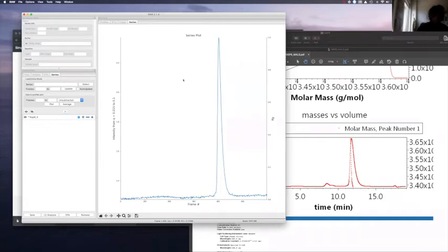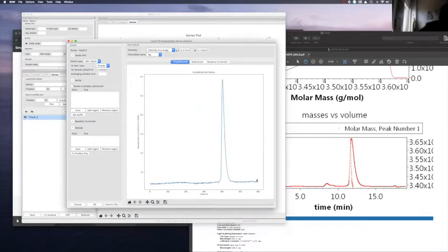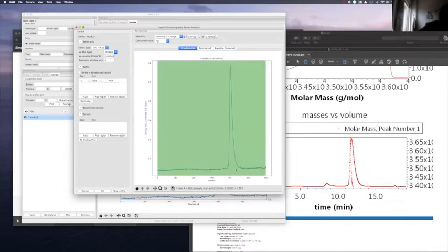And how we're going to analyze it, the next step. If you click on this series here, as Steve mentioned, you can go to LC series analysis. Here, what you see is the same as what you've seen before, but now we need to adjust the buffer first. So let's say I want to add the region of buffer.